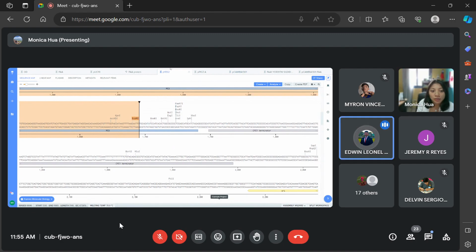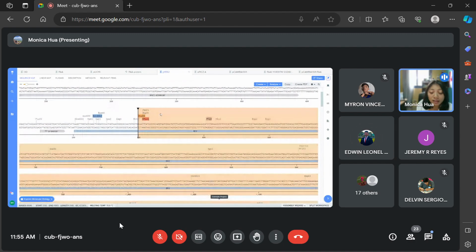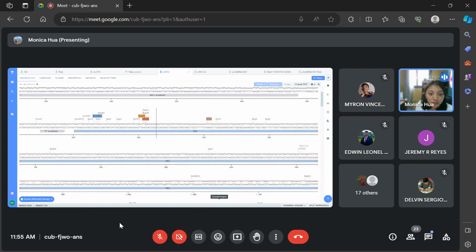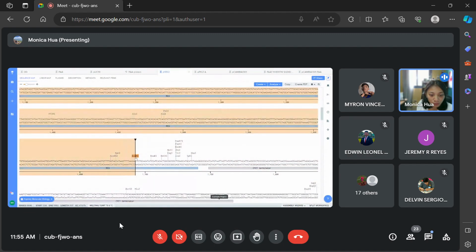Can you explain how you visualize it? You said you could visualize with the amino acids and the annotating. Yeah. So for me to annotate it, you don't want to include the restriction enzyme site, right? You want to start at ATG, which is the methionine that starts translation, and then go all the way to the end, around my EcoRI at the stop codon.